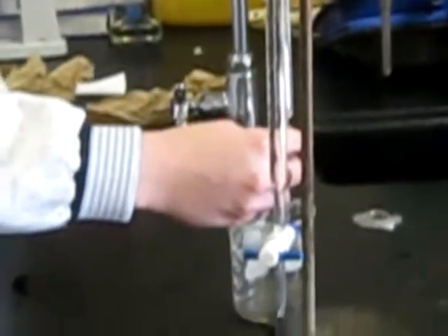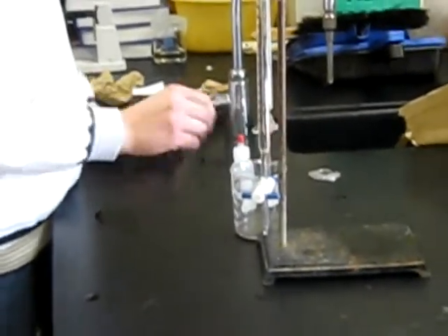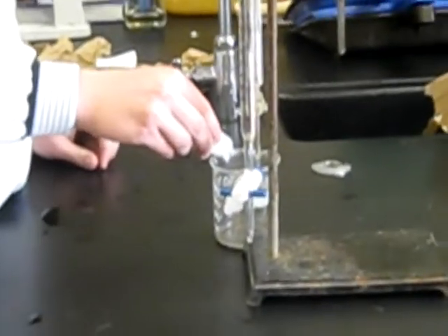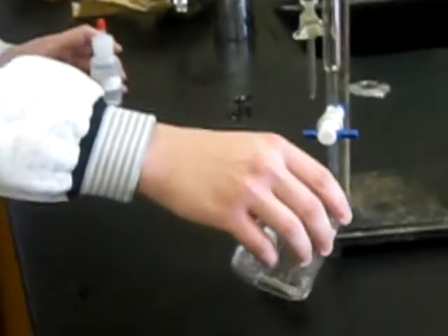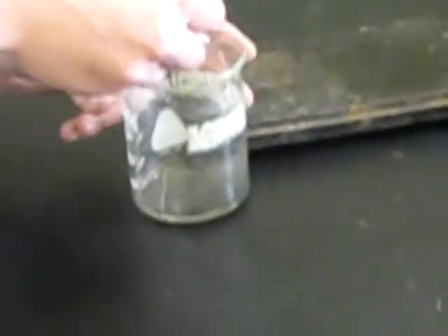So now that he's added in the acid, he's going to add in 3 drops of our indicator, phenolphthalein, in the little bottle there. What that'll do is change the color of the acid once we've added the proper amount of base to neutralize it. After he's added that, we'll move the beaker over to the base underneath, and we'll slowly add in base until the color begins to change, and he'll swirl the beaker as he does that to mix it properly.